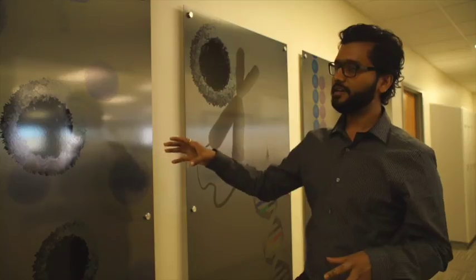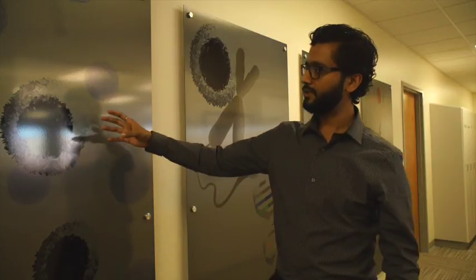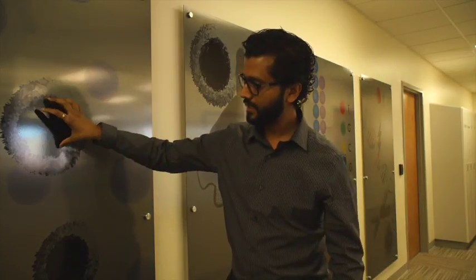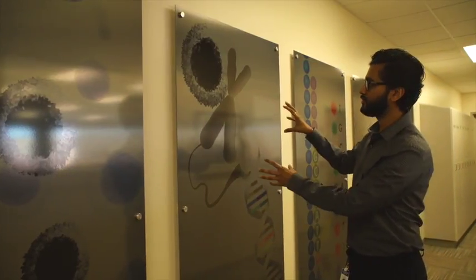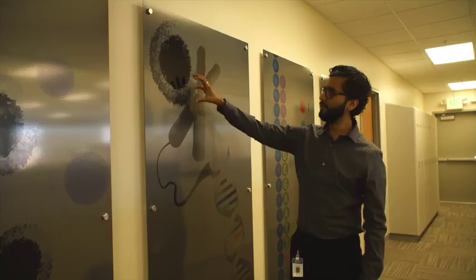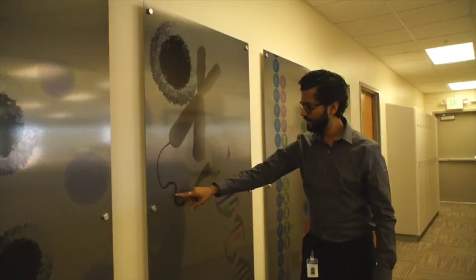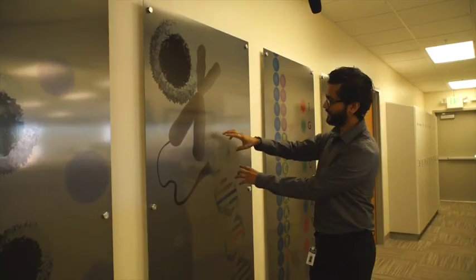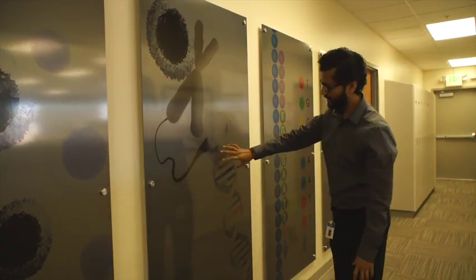So what we do here in the genomics laboratory is, we get either a tissue chunk or a slide which has both tumor cells and non-tumor cells. So what we do is we selectively pick these tumor cells, and we extract DNA from those tumor cells, which is what you see in this frame. As you can see, this represents the extracted genetic material, which is a chromosome. Basically the DNA is wrapped around the chromosome in a structured fashion, and that's what you see here.